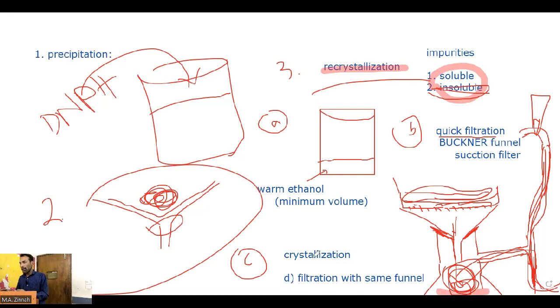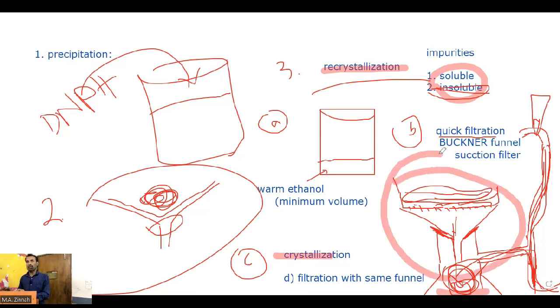কনিক্যাল ফ্লাস্কে যে সলিড গেল, that was cooled down to get the solid crystal, কিন্তু ক্রিস্টালের উপরে তো লিকুইডও থাকবে, রাইট? সলিউশন ইথানল, তো তাকে আমরা কি করব? এরকম আরেকটা সেট আবার অ্যাপারেটাস, again fresh Buckner funnel, this time তোমাকে আর প্রিহিটেড করা লাগবে না, কারণ আমরা সলিডটাকে নেব এবার, ওকে? এর আগে ফিল্টার করে আমরা লিকুইডটাকে নিয়েছি, using Buckner funnel you collected the filtrate. এইবার আমরা আবার ফিল্টার করব, করে আমরা কি কালেক্ট করব? রেসিডিউ অর দ্য সলিড দেয়ার, ওকে?